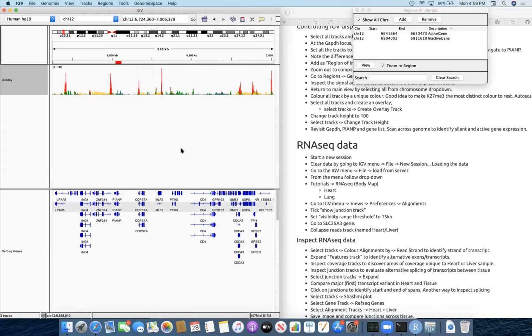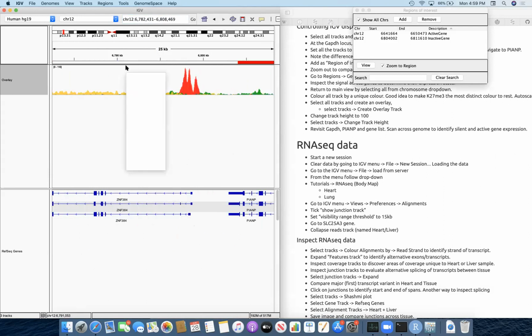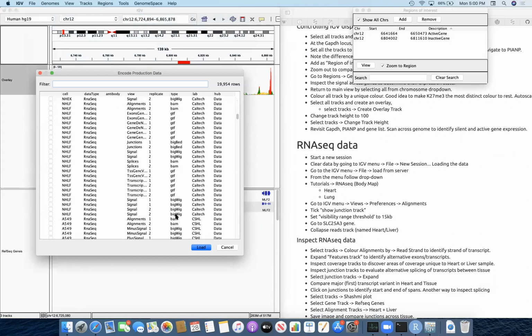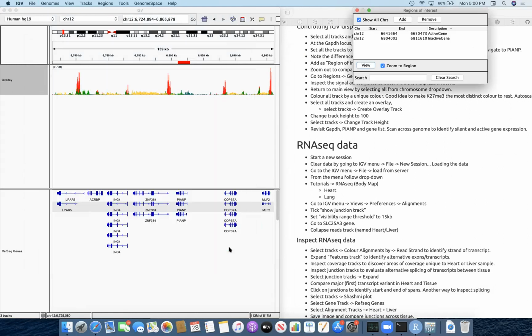But I hope it shows you that, using public data, you can get an understanding of, in this case, the state of all these genes. Are they expressed? Are they repressed? And this is just ENCODE data from the tutorial, but as we know, a ton of ENCODE data is available to us. So if you have a favorite gene under a favorite condition, it's worth looking at ENCODE and seeing if you've got something you can pull out straight away. Maybe review your hypothesis without having to do any experiments yourself.